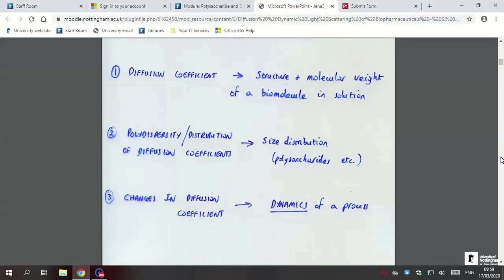destruction of bacteria, and following how bacteria change when they germinate, bacterial spores when they germinate, and what happens when you apply disinfectants and things. It's a great technique for looking at large macromolecular assemblies and size distributions, and also changes. You can follow a process as a virus particle, for example, changes when, with some viruses, you add calcium and it'll take up water for some reason.